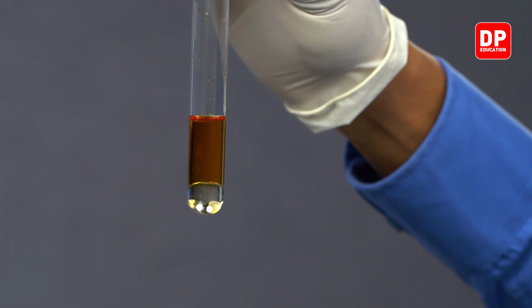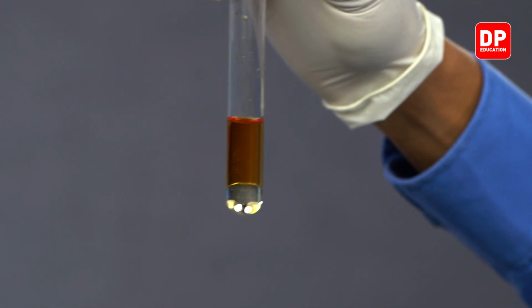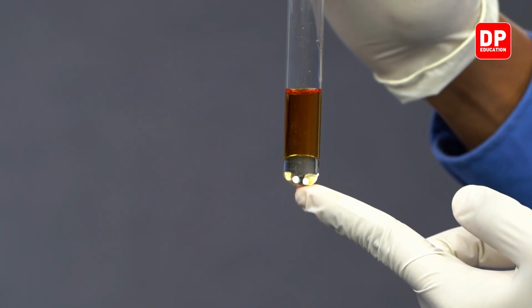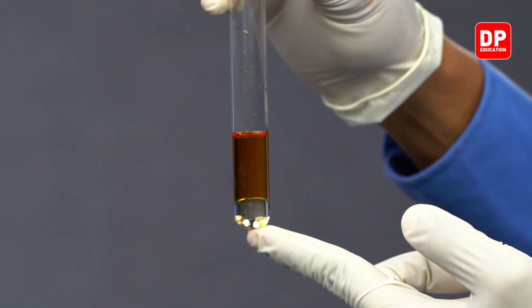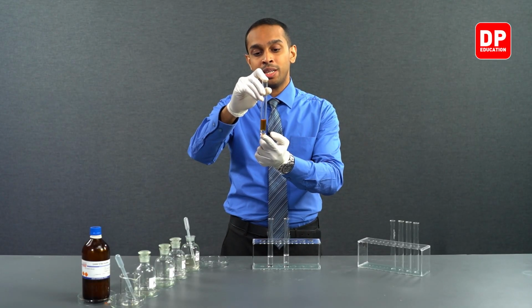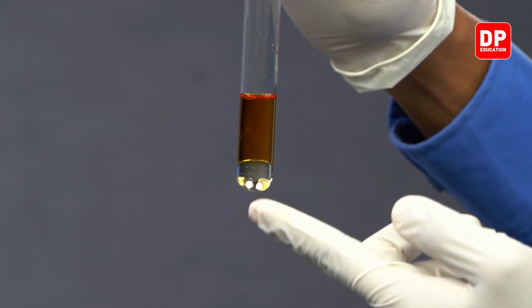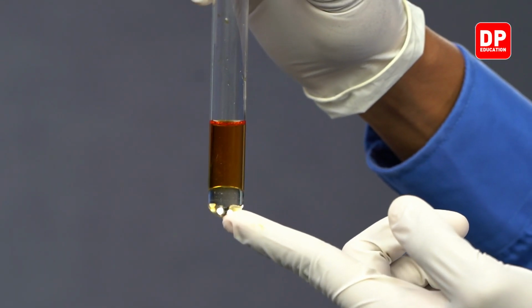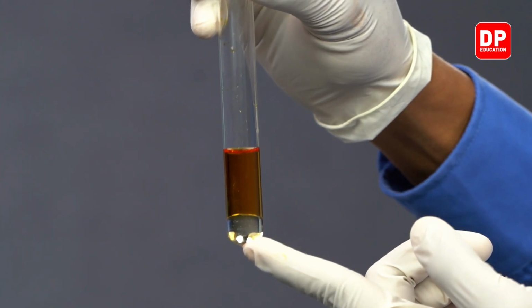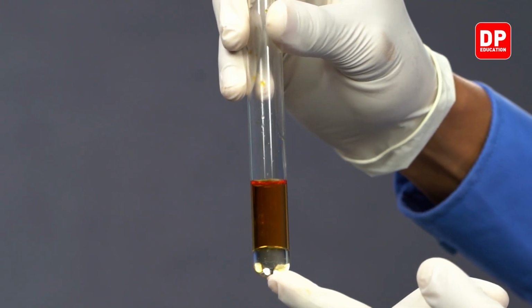Iodine, or I2, is a non-polar substance, and carbon tetrachloride at the bottom over here is also nonpolar. So as you know, like dissolves like, which means I2 should be dissolved more in the nonpolar carbon tetrachloride layer. So to do that, we have to first of all mix this mixture thoroughly. So let's do that now.